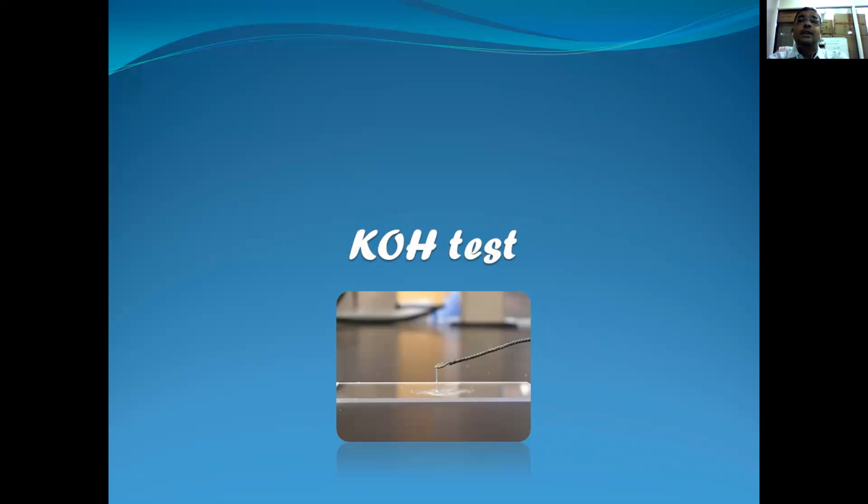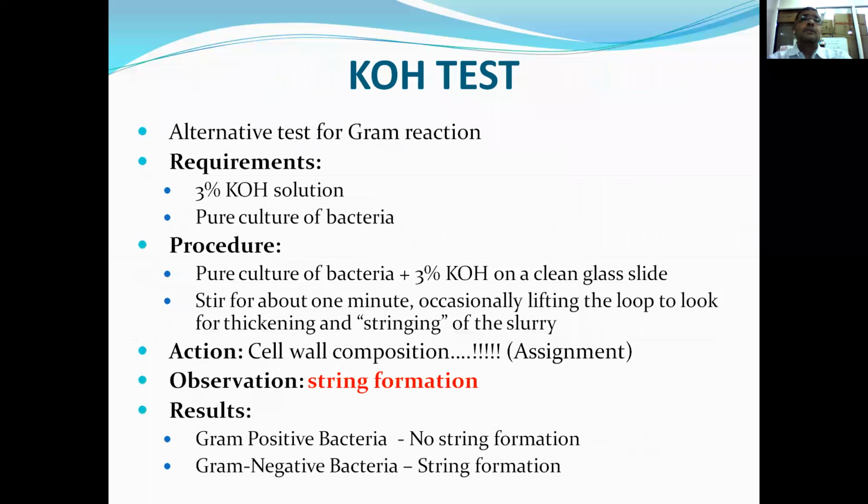The first is known as the KOH test. KOH is the abbreviation of potassium hydroxide. So we'll see how we can perform the KOH test. This is generally considered an alternative to gram staining. If you are not able to perform the gram staining, then by performing the KOH test, you can tentatively say that organisms are gram positive or gram negative.